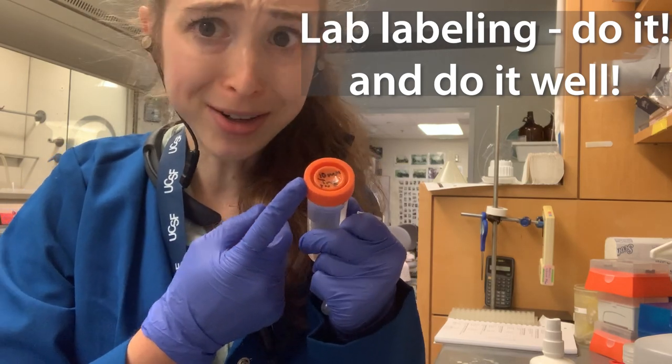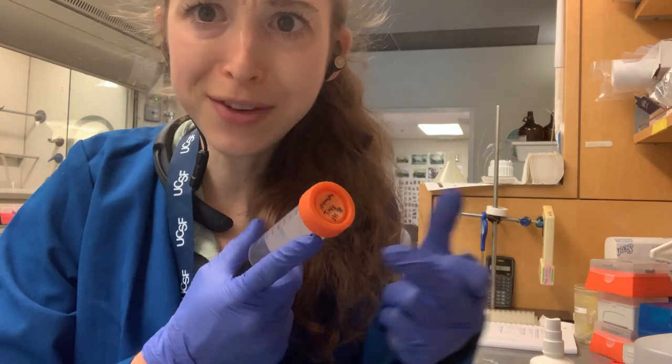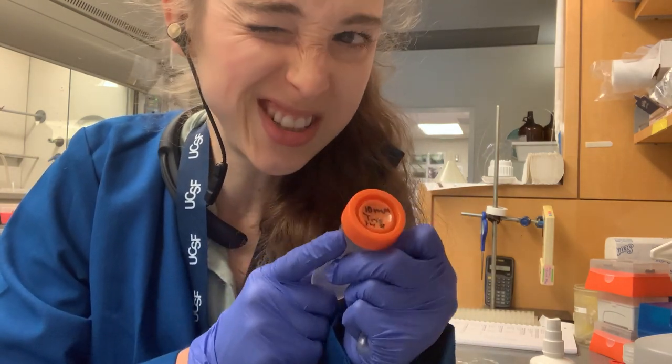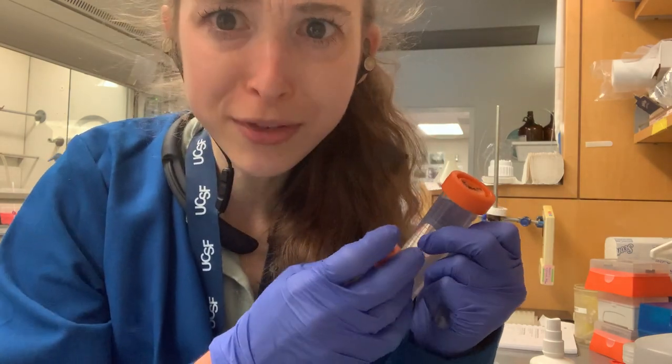Apparently these domed caps make a better centrifuge seal, but they make it so much harder to label things. I feel like they do this just to torture you by making you squish all the little writing into the center. There's an arch thing that makes a better centrifuge seal.